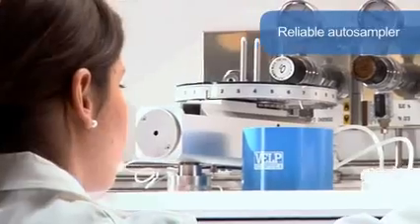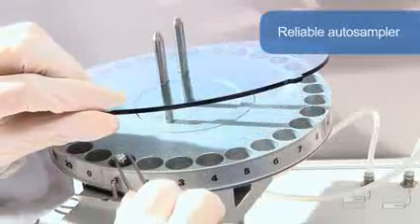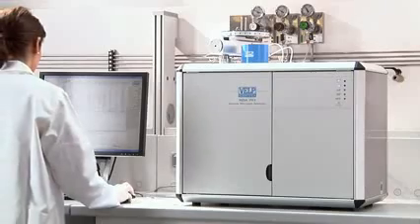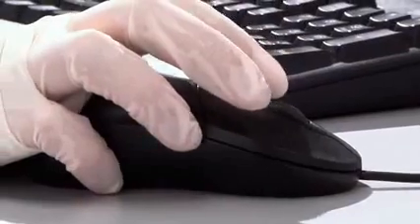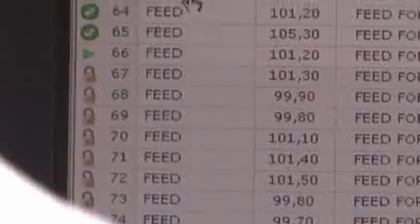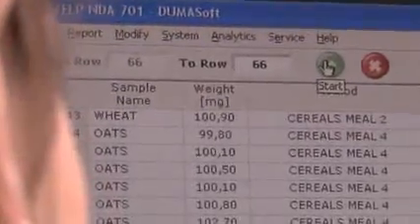The instrument includes a reliable auto-sampler that can manage up to 4 disks, each of 30 positions. Automatically, the sample is purged in a stream of helium, eliminating all the traces of atmospheric nitrogen — essential because the NDA701 is able to reach particularly low detection limits.